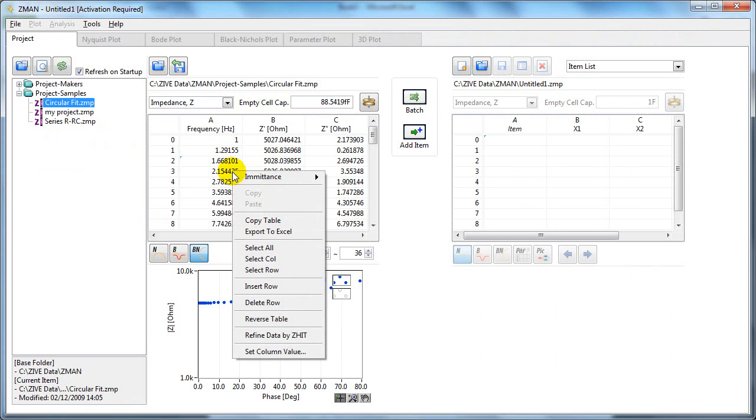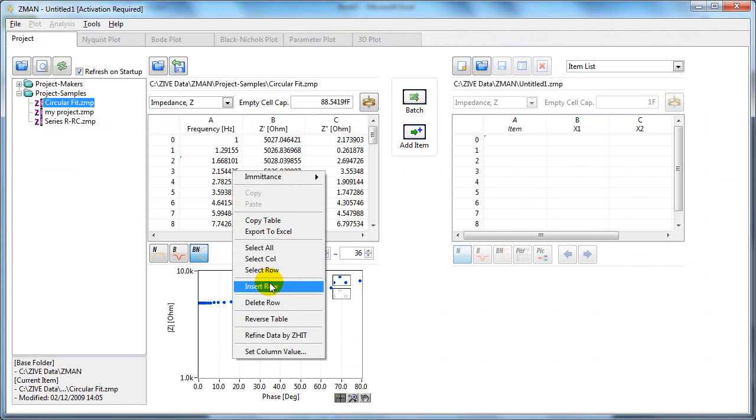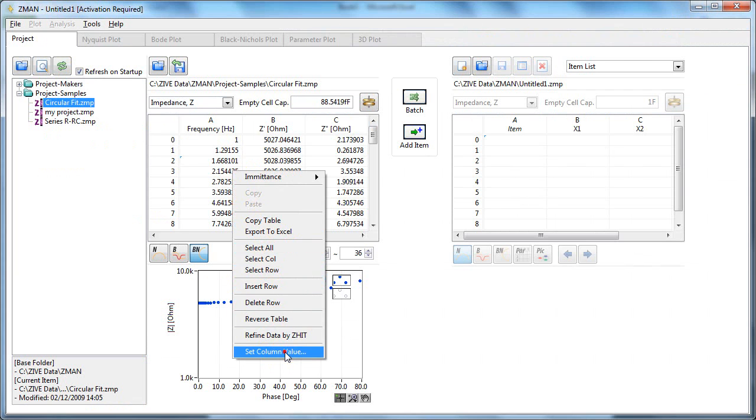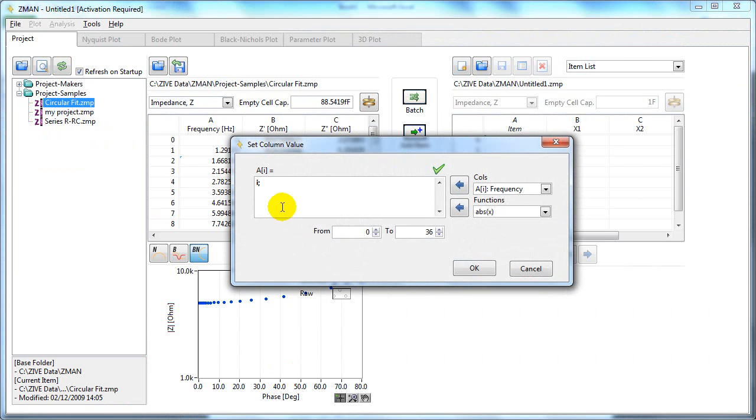You can also select rows and columns, insert rows, delete rows. You can set column values. This lets you put an equation in to make the values for that column.